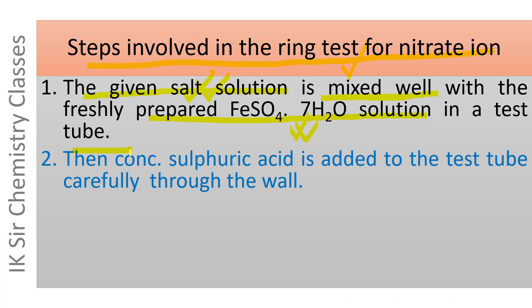Then concentrated sulfuric acid is carefully added to the test tube so that it does not mix throughout the solution. Concentrated sulfuric acid is added carefully so that it goes to the bottom of the test tube without mixing with the solution.